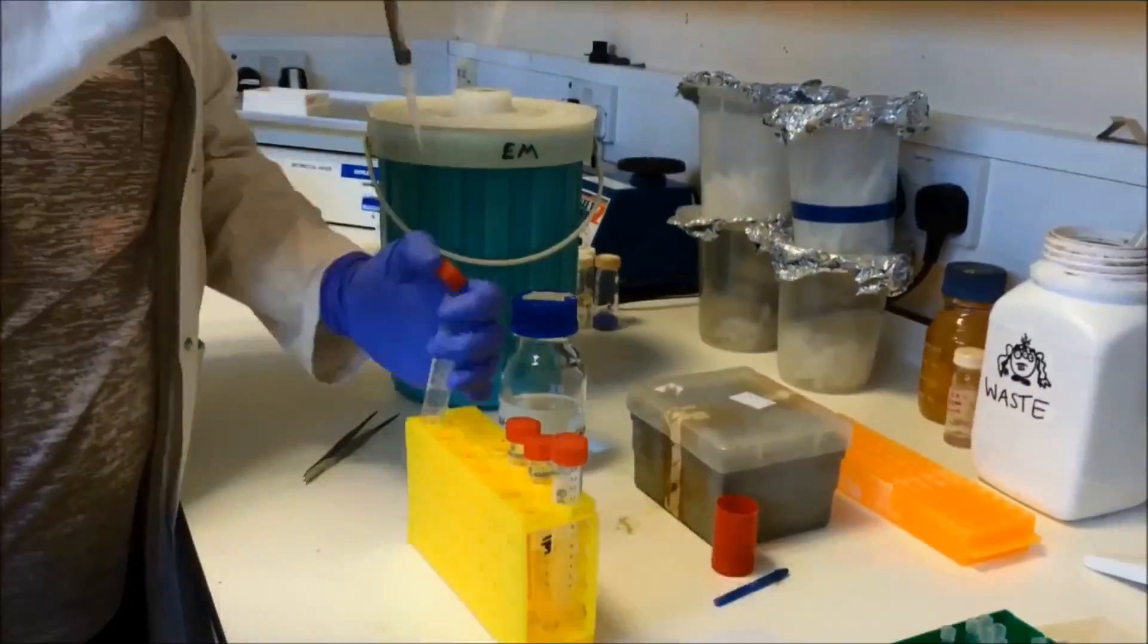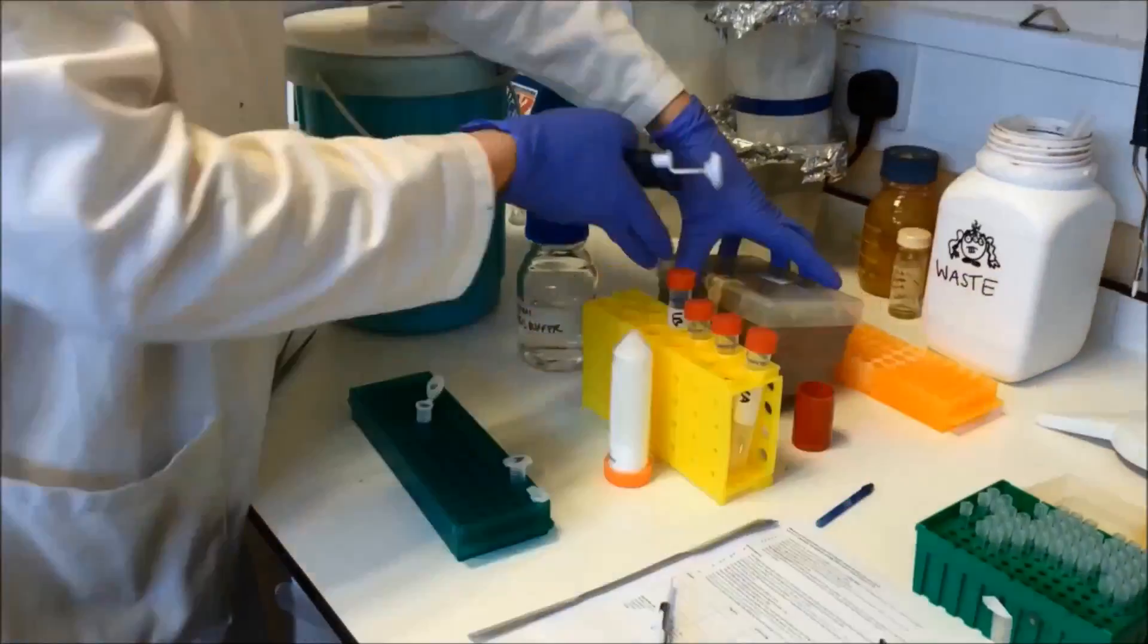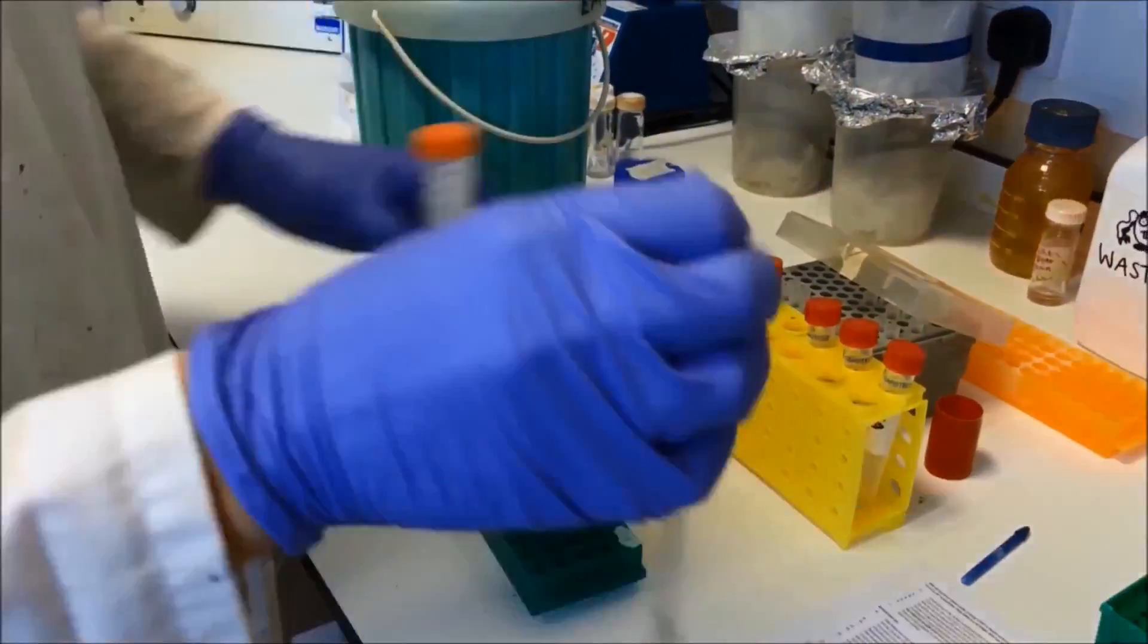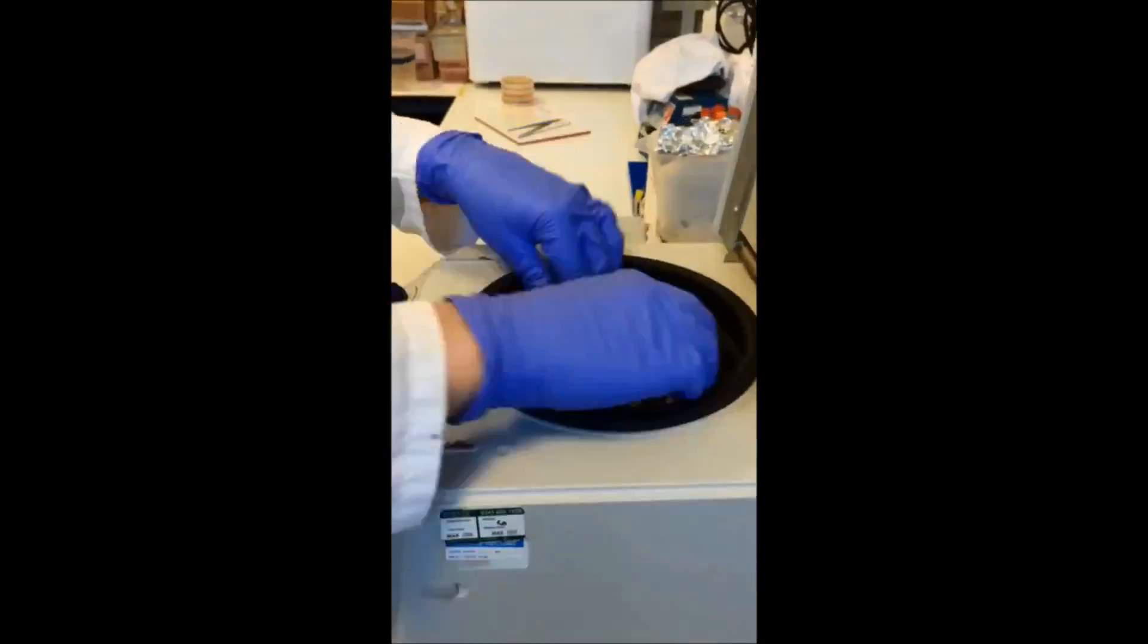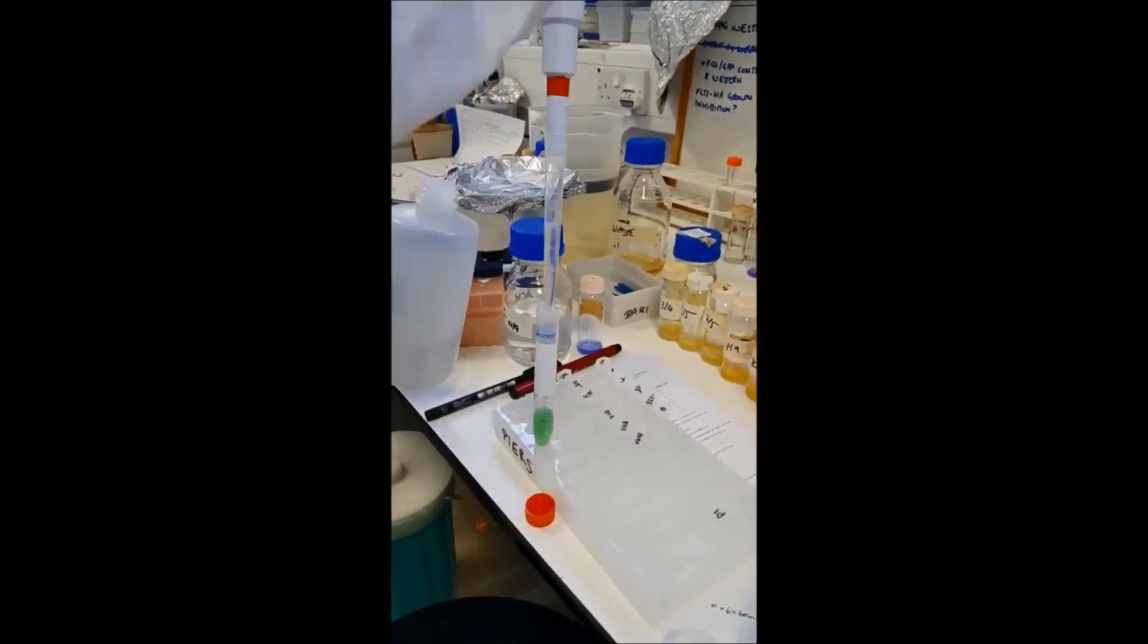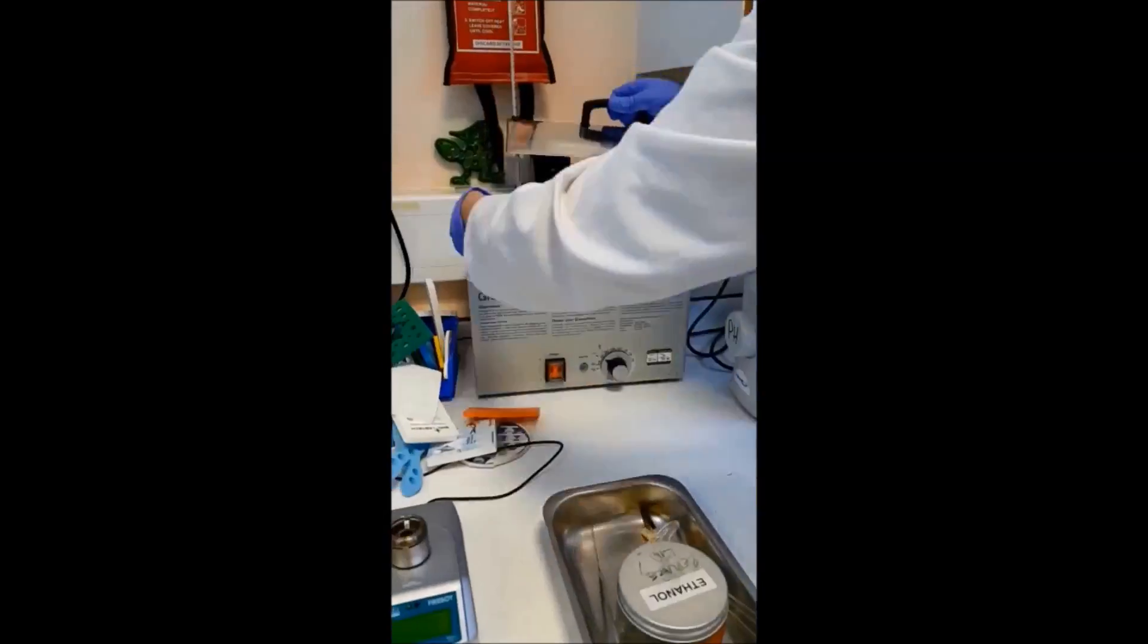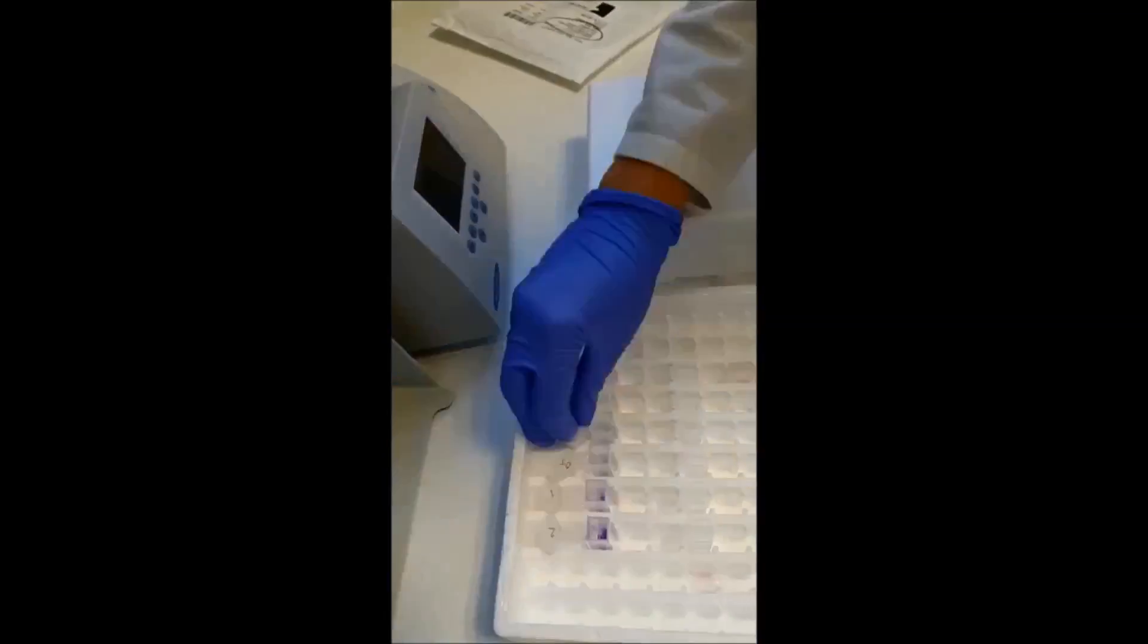A buffer is then added which helps to keep the proteins stable and make sure they don't break down. Next, we need to work out how much protein we have. To do this, we use a color-changing assay. The deeper the purple color, the more protein you have.